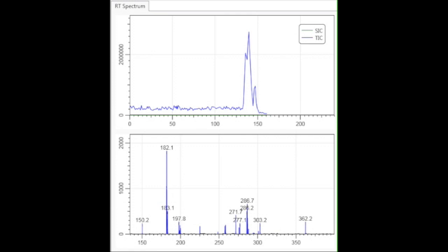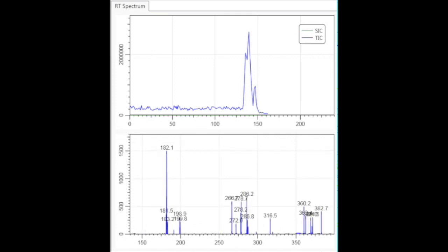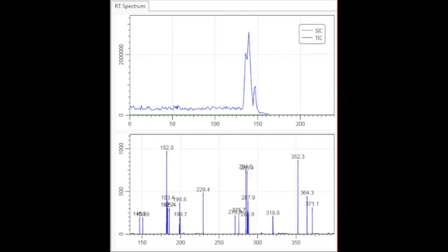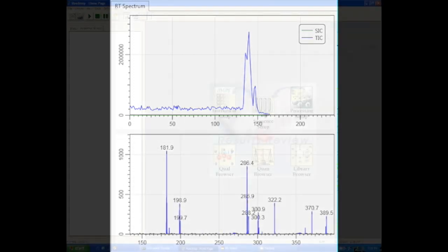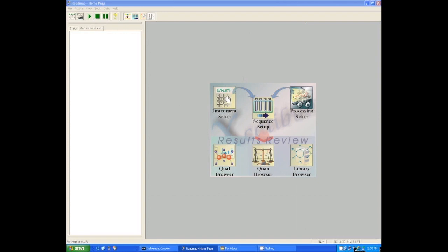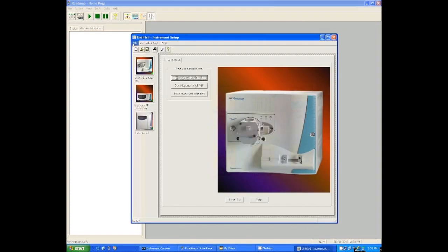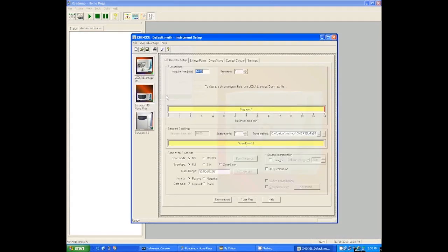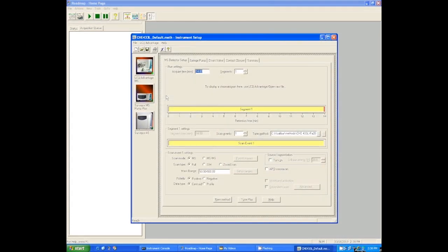Next I'm going to show you how to set up these kinds of experiments on our mass spectrometer. You're going to do what you did before and boot up a default method, and we are going to return to those mass spectrometer parameters.